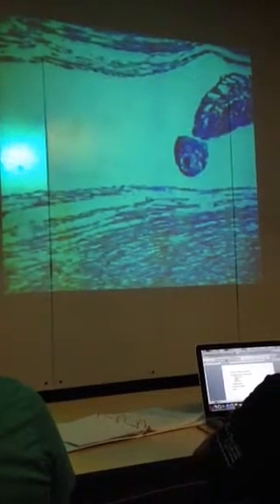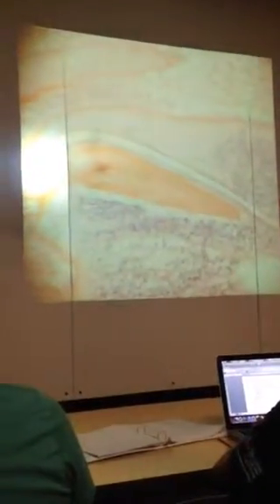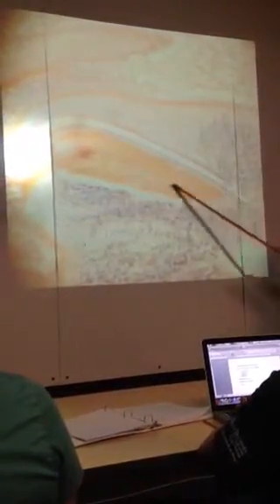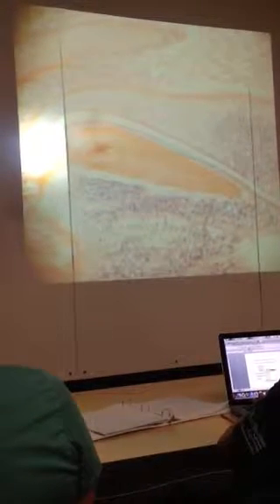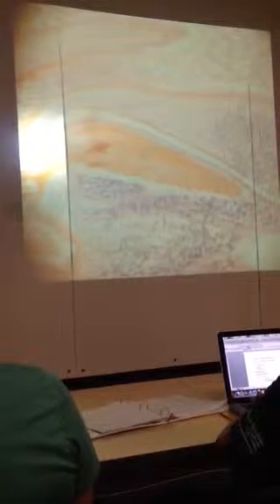This is what the actual photomicrograph of the specimens looks like. This is the glomerulus right here, see? And this is the proboscis alone, so this is just part of the tissue of the proboscis, right? Okay, there's your stomochord right there. See it? Would anybody miss stomochord, or is that fairly obvious? So if I put that on the test, you won't be upset, right?